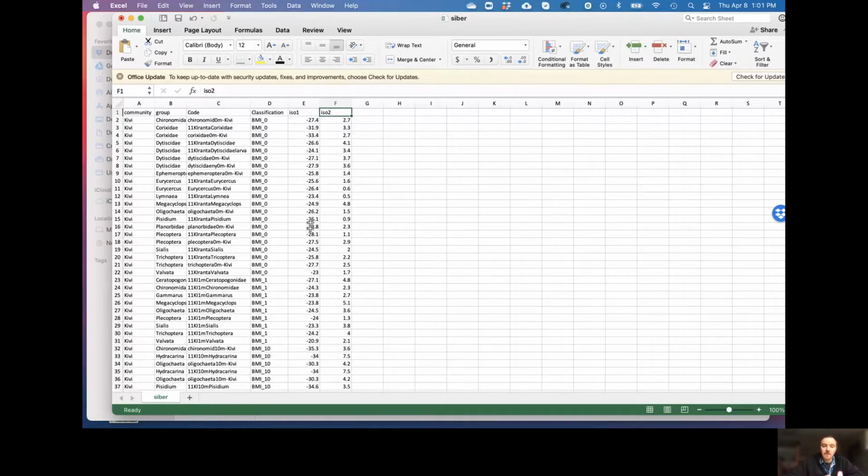One thing I've used in the past is where you run the post two-source mixing model. Remember, I mentioned that one of the benefits of that is that you can get individual values. So we could get a littoral resource reliance derived from carbon and an estimate of trophic position derived from nitrogen, put those in here instead and calculate the isotopic niche, but based off those values that have been corrected for baseline effects.